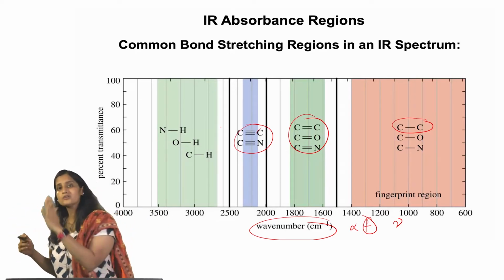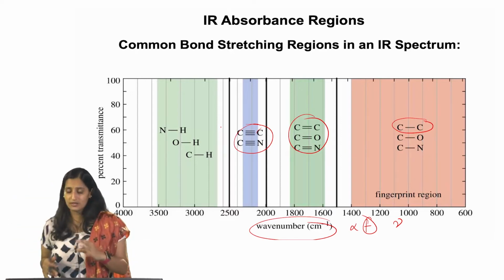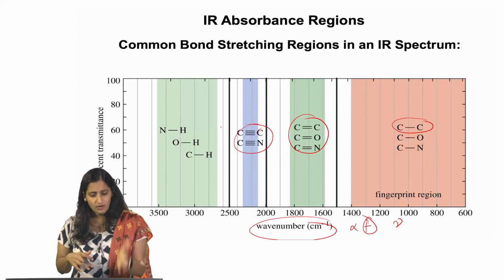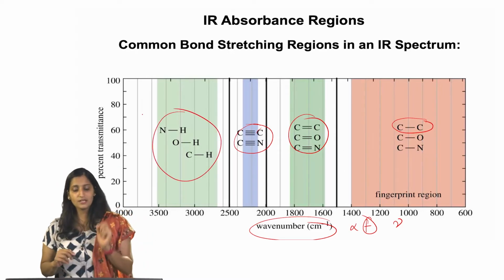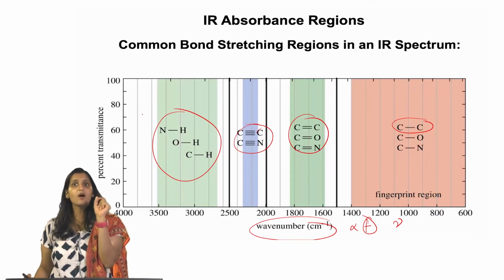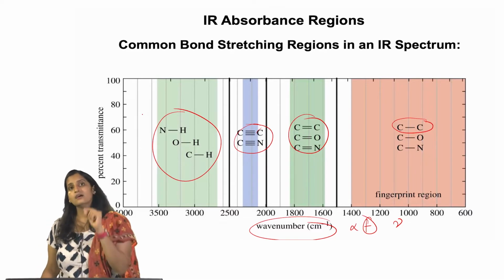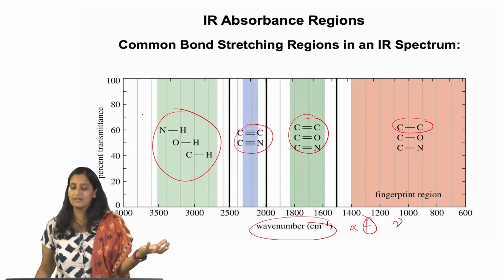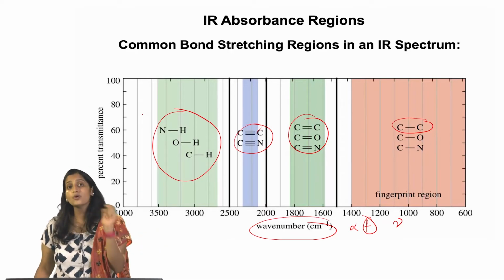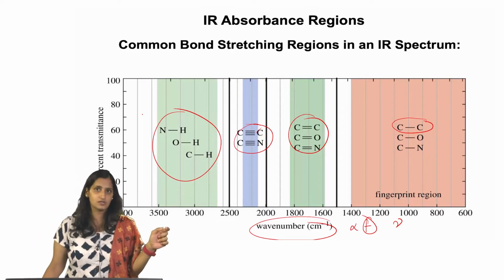So, correspondingly you also see that in the IR spectrum, the machine readout that we were looking at. Also, herein from 2500 to 4000 you have your single bonds, but now they are not of the same atom. You have one very light atom, right? So, as we were talking about, the springs with the lighter masses vibrate with a higher frequency. So, you have NH, OH, CH occurring between wave number 2500 to 4000.